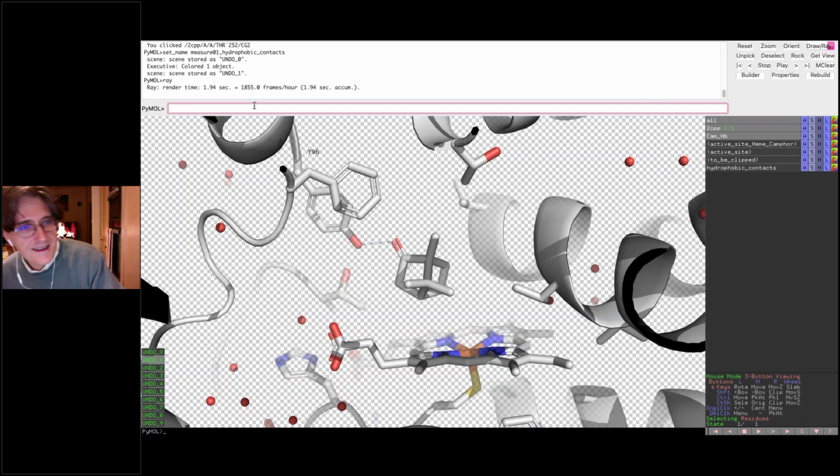And okay, I found this on the web. Sorry about that. And so it casts a virtual ray throughout the scene, pixel by pixel, and decides whether it's in shadow or not, whether it's the edge of an object or not. So you'll notice there are now shadows, for instance, in this scene. You can see shadows there.